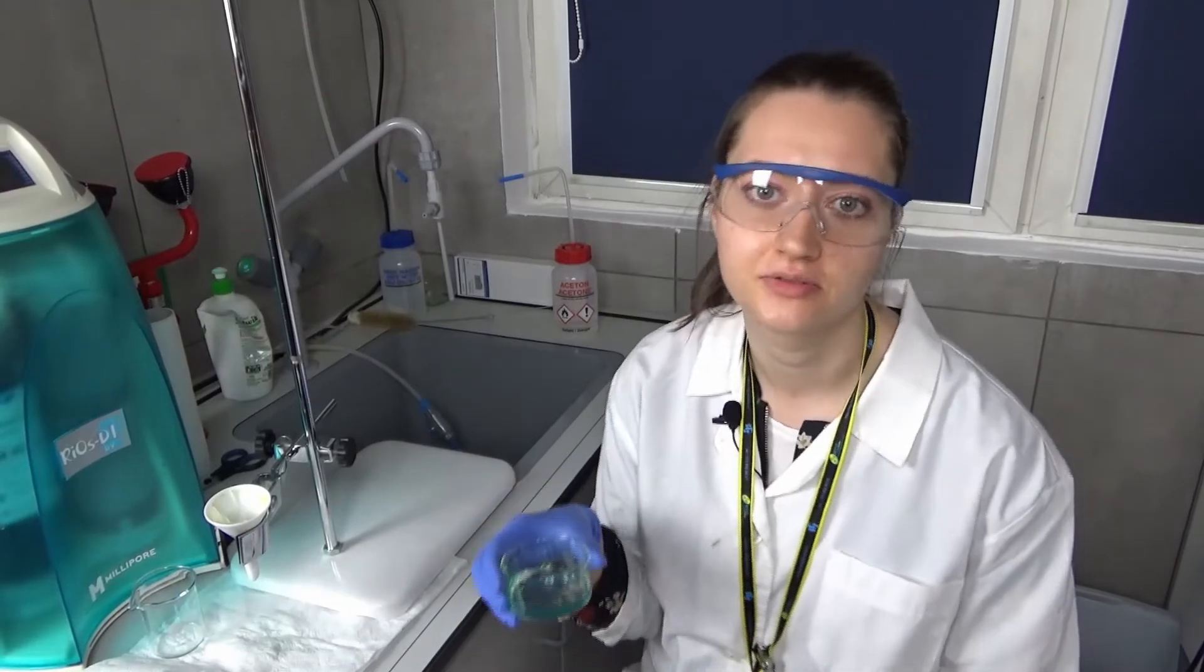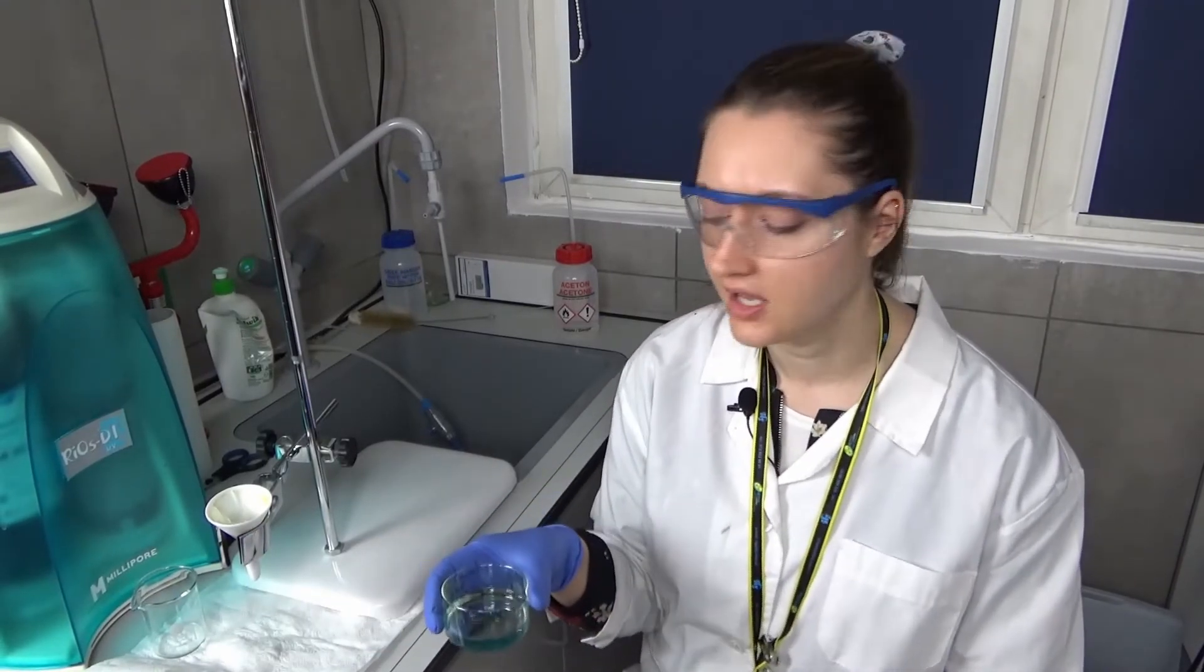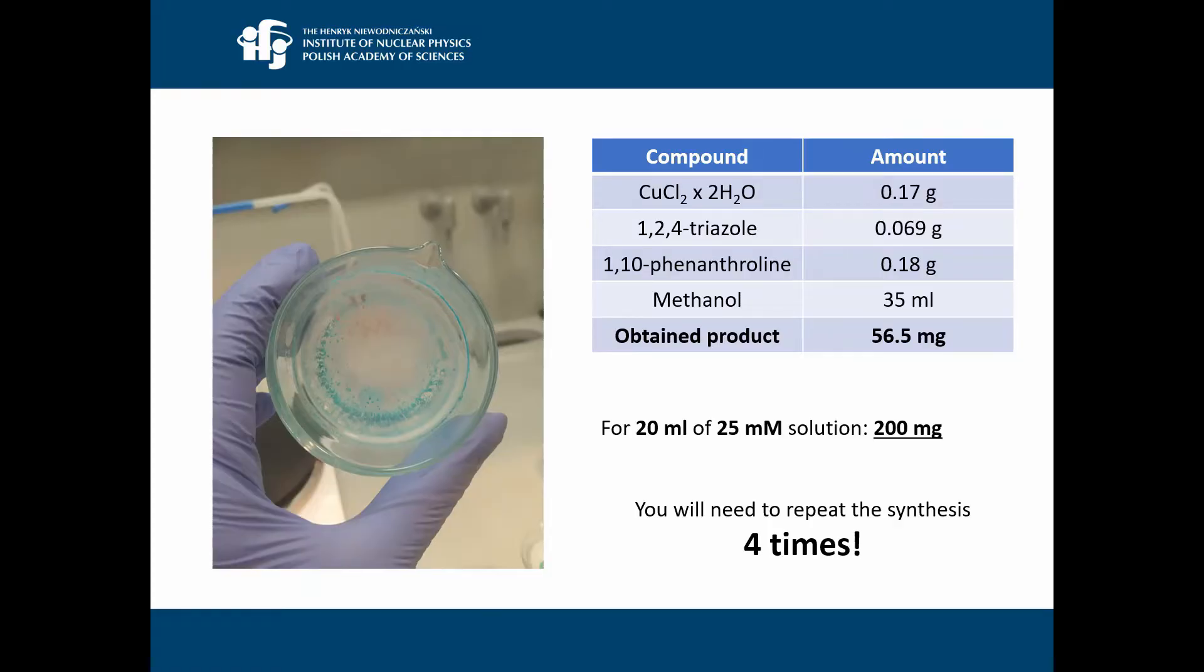The last part is waiting. We have to wait for the methanol to evaporate and for the product to crystallize. After one night, I came back to the chemistry laboratory to check the sample. As you can see, all the methanol evaporated. I took off from the glass all this sample and I weighed it. From the presented used amounts of substrates, I obtained 56.5 milligrams of the product. If I wanted to prepare for XFEL examination, for example, 20 milliliters of 25 millimolar solution, I will need 200 milligrams of this product. Therefore, I will need to repeat the whole synthesis four times, of course if each synthesis provided me this amount.